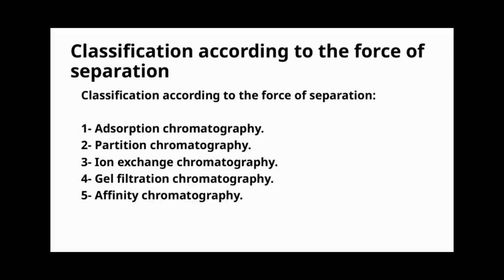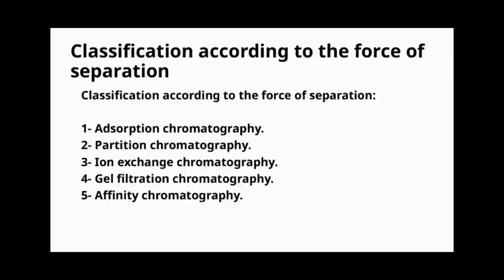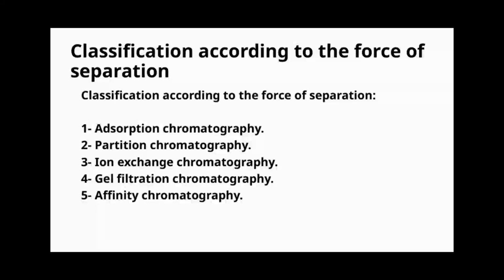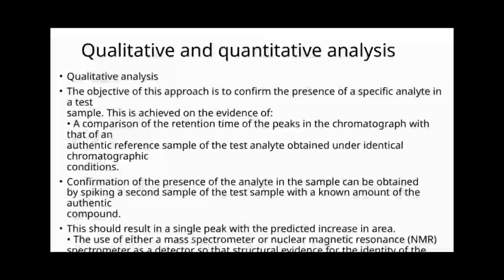As we move forward, keep in mind how each force of separation plays a crucial role in tailoring the technique to the specific needs of each experiment or analysis. Now, let's delve into the qualitative analysis. The main goal here is to confirm whether a specific analyte is present in a test sample.